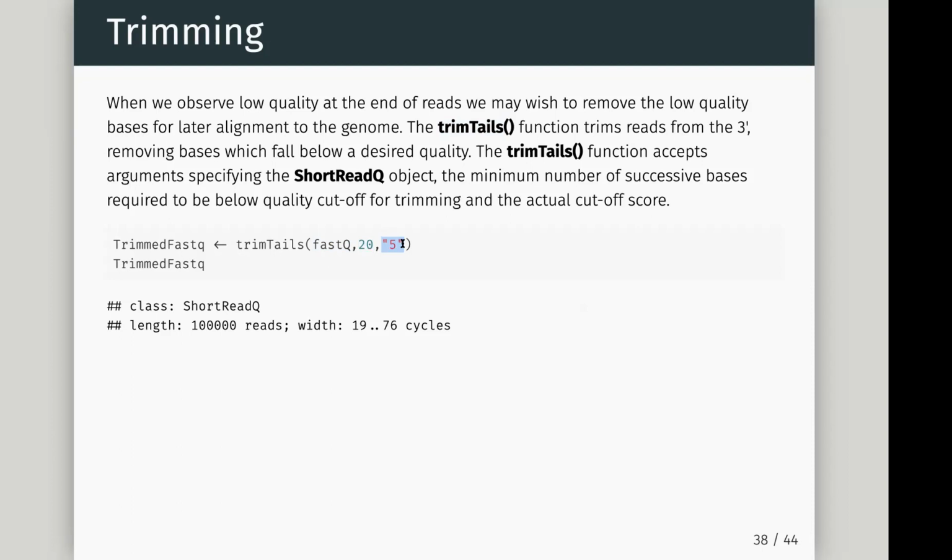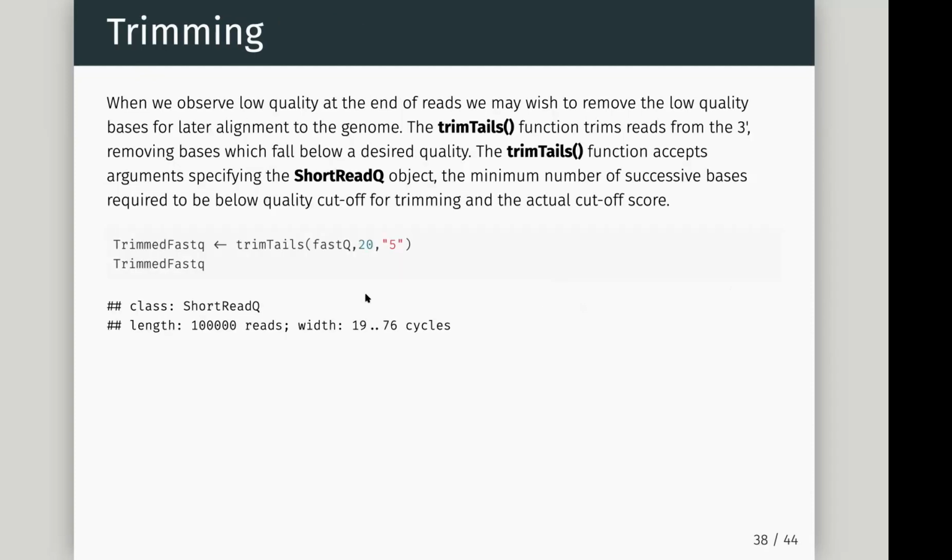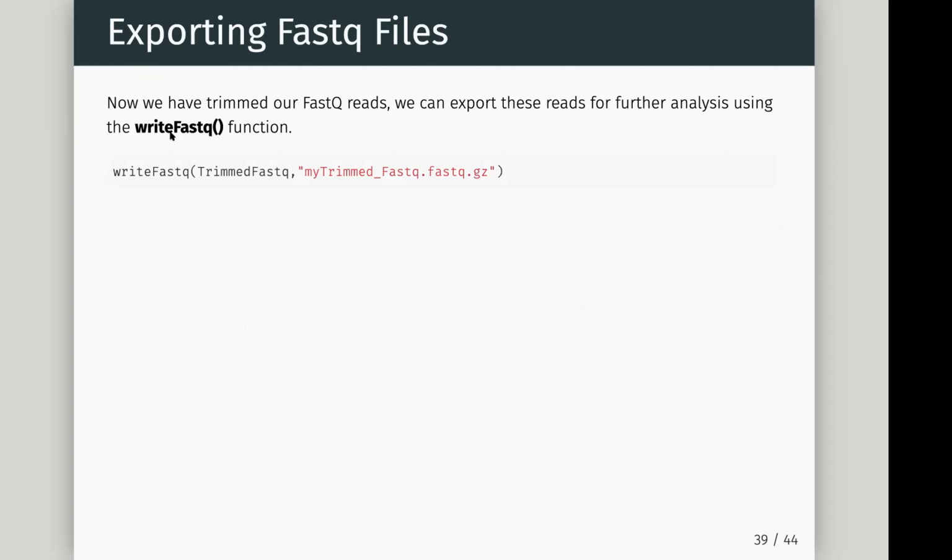So most often you will review your data first, and then you will go, geez, I've got this drop off of quality. I may need to go and do some trimming here. I'm just showing you how. There's trimTails, there's trimFront. There's lots of options for us here.